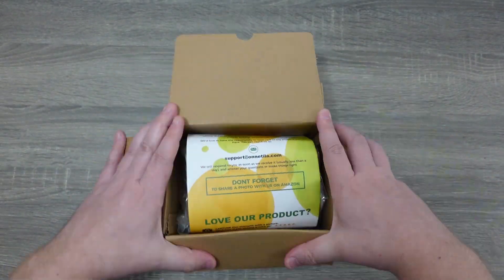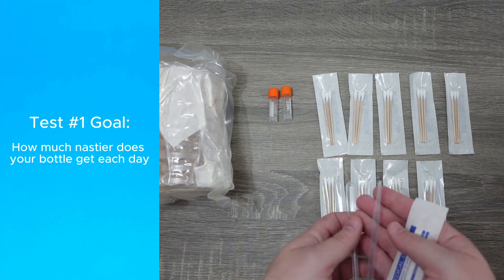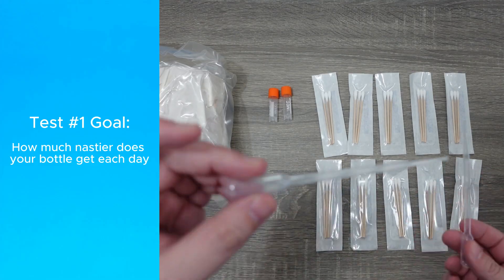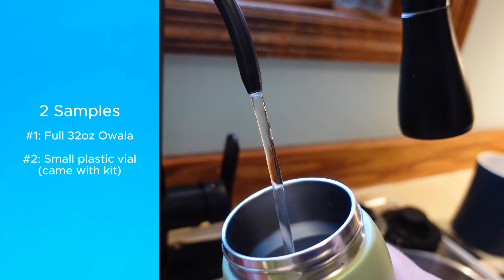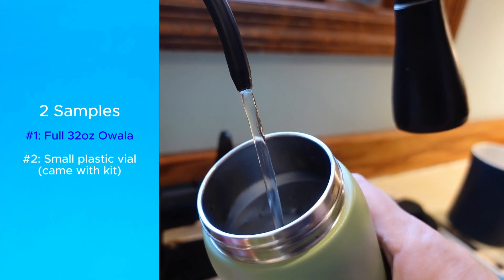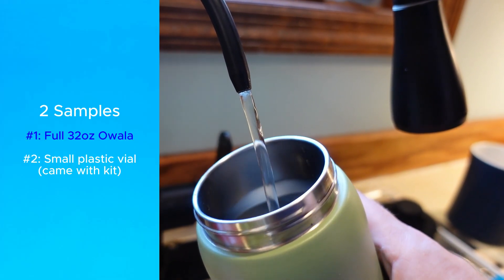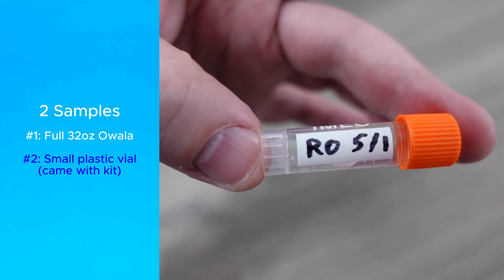So I set up two different tests. The goal of the first test was to see how much bacteria growth occurred with each successive day, mainly around the contact points like the spout and the seals. First, I took two samples of water from our reverse osmosis system, including a full bottle sample in this freshly cleaned 32 ounce Owalla, and a smaller sample in this little plastic vial that came with that bacteria test kit.